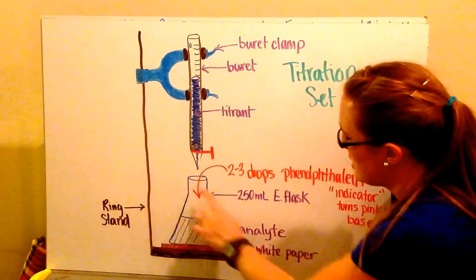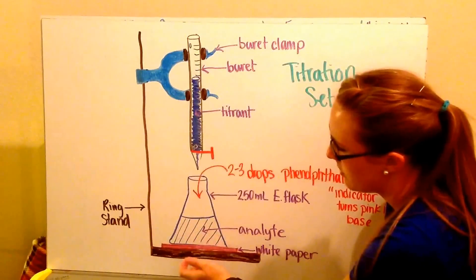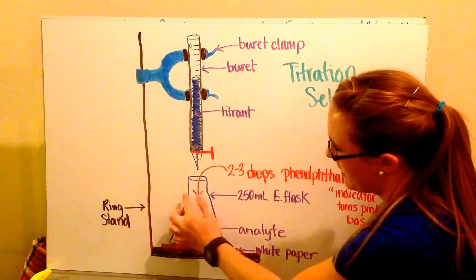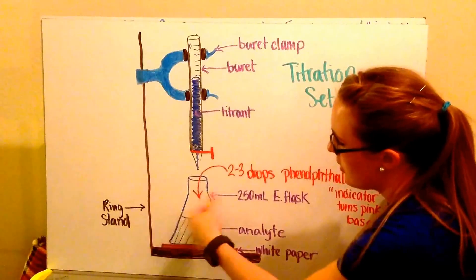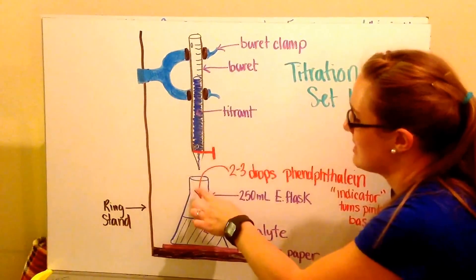I'm going to do this in an Erlenmeyer flask as opposed to a beaker because it has sides that are at an angle, so I can swirl it and there won't be any backsplash from when I put in my titrant.